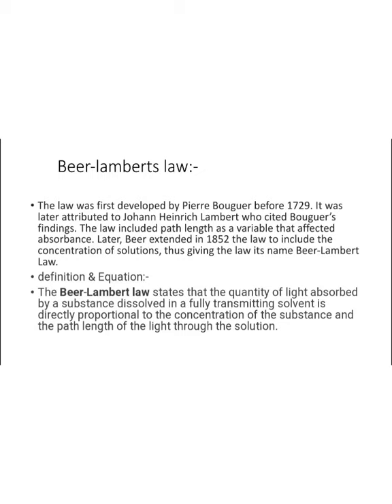Later, in 1852, Beer extended the law to include the concentration of the solution. Absorbance is also affected by concentration, thus giving the law its name, the Beer-Lambert law. Then we discuss the definition and equation.